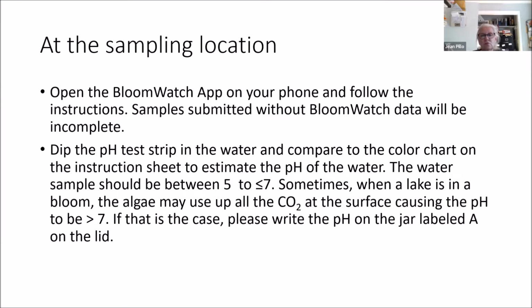So also after you do the Bloom Watch app, the first thing you're going to do is you're going to test the pH of the water, and you'll compare the color on the dip strip to the chart on the instruction sheet.